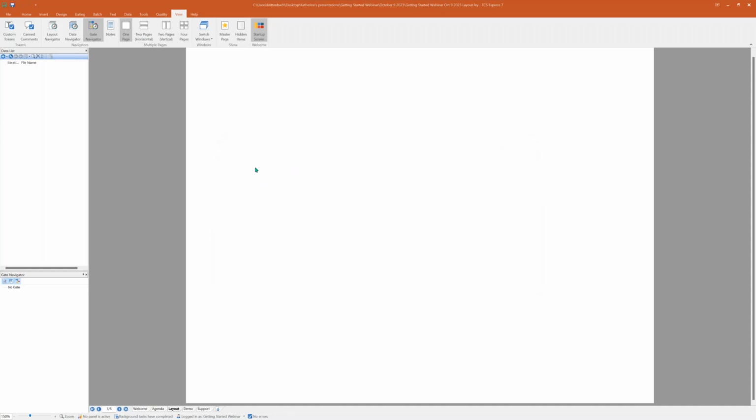And this is FCS Express. You can see that it looks like PowerPoint. We have a Microsoft Office-like interface to make the software easy to use. You can navigate through the tools in this tab and ribbon system at the top. We have tabs like the Home button that have prefabricated page designs where you can edit text, arrange objects on the page. We have the Insert tab to insert objects.